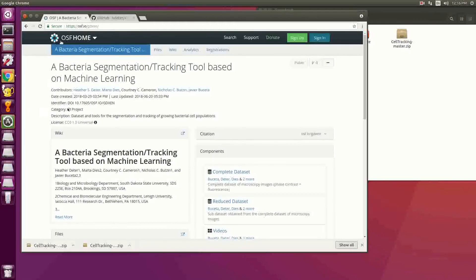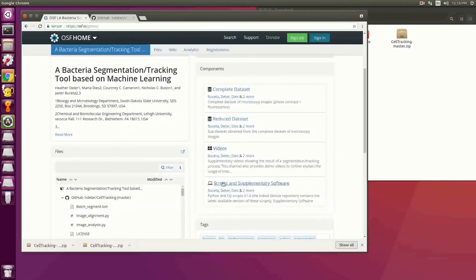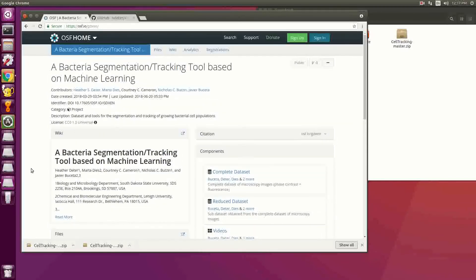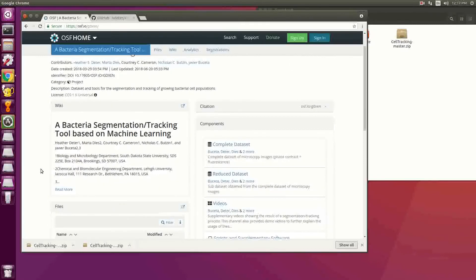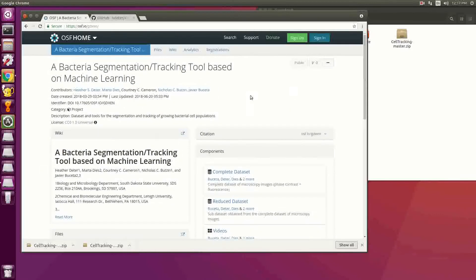This here is our online data storage site at OSF. We have all the videos, scripts, software, and datasets that have been published in our book chapter in Springer Methods, and the citation is also available here.